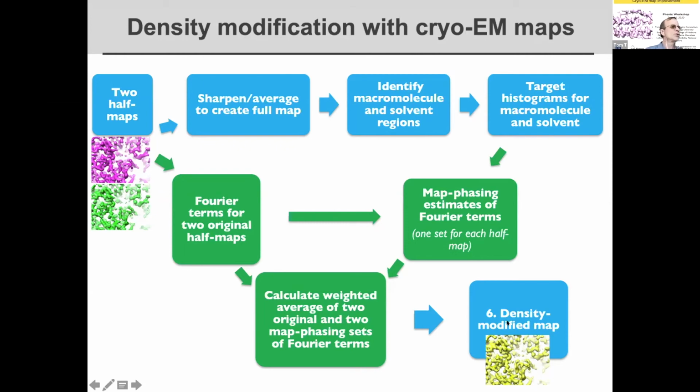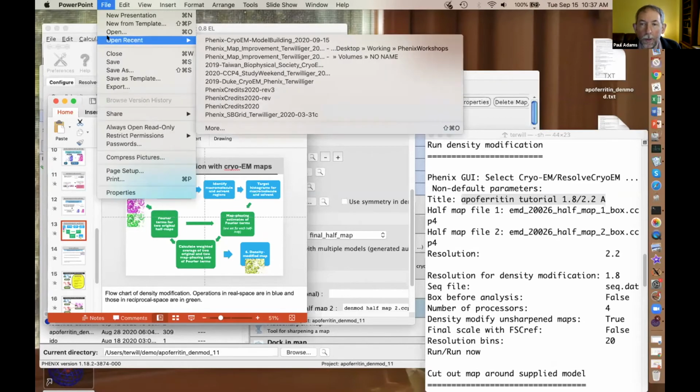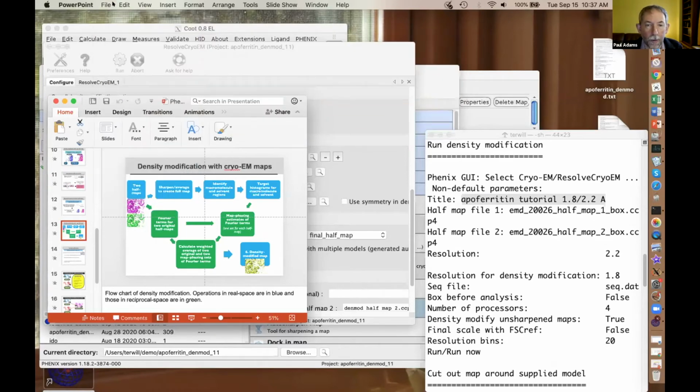Let's see, were there any more questions on that before we go on? There is a question about, do you have an example of the density distribution histogram? Yes. Let me pull out of this tutorial and I think we can find one real quick. And there's a question about how can we obtain these distributions, but I guess you'll explain that they're pretty uniform, they're pretty constant. They're not case specific.